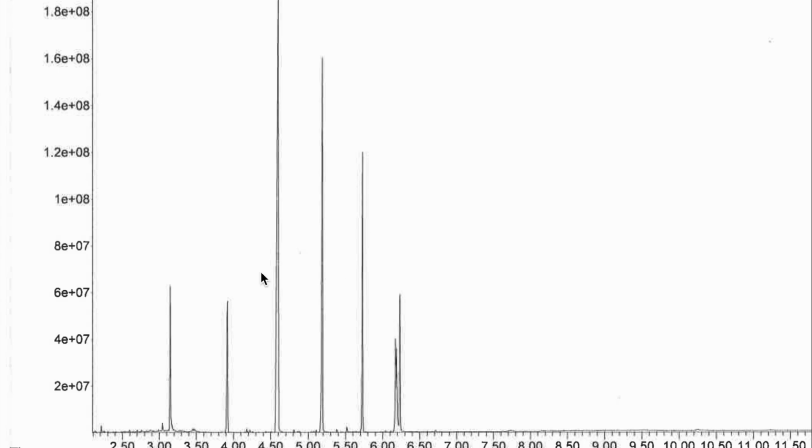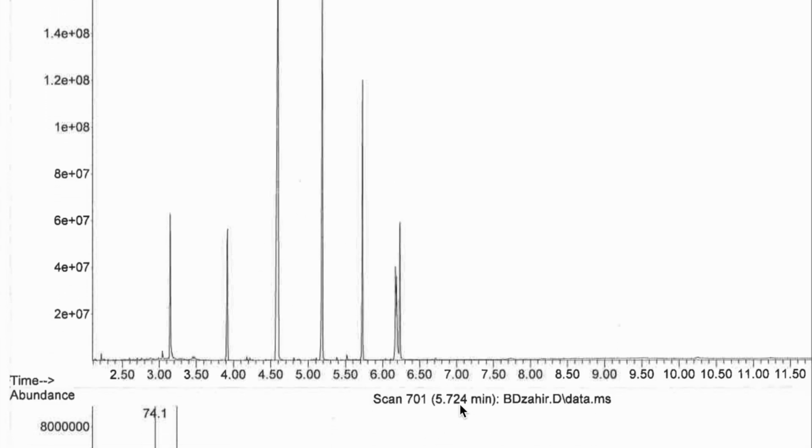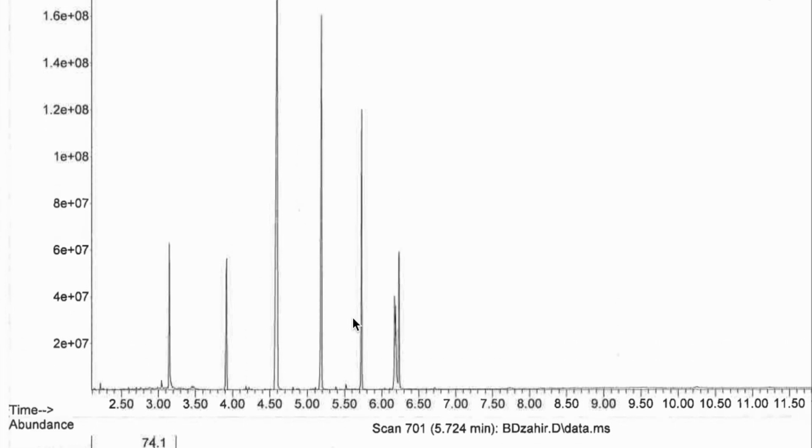So if we look at scan number 701, again at about 5.7 minutes, we have 120 million ions hitting the detector.